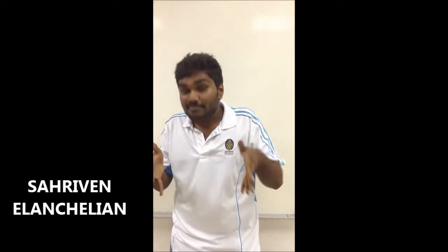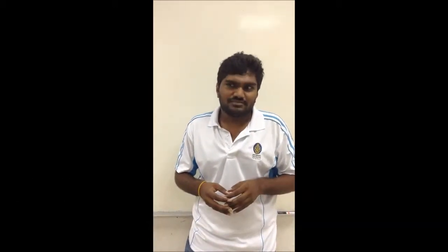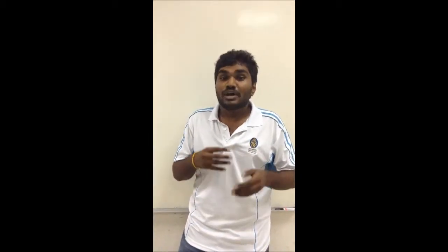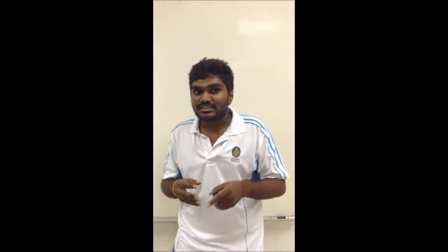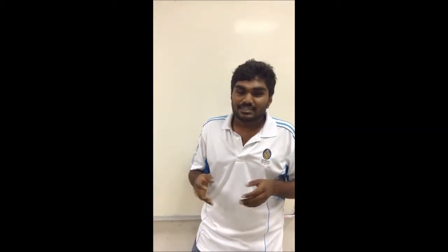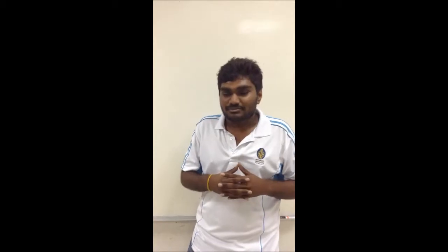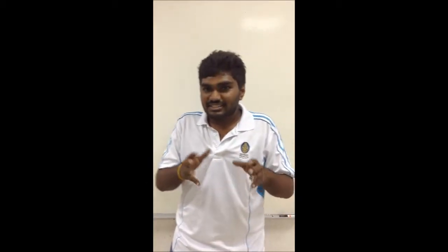Everyone, today in this video we are going to show you what is gas chromatography. Before we move into the deep explanation of gas chromatography, let me give you the definition. Gas chromatography is a chemical analysis technique that is used to identify and also quantify a compound in a mixture based on the volatility of the particular compound. I think you guys are still blurred. Okay, don't worry, stay tuned in this video.